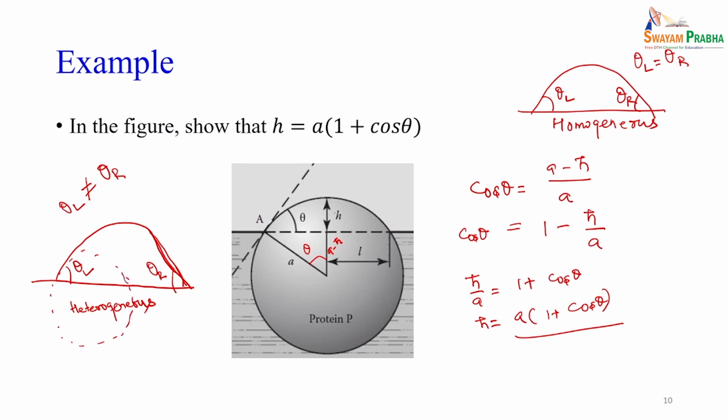You can fit one circle to the left side, and at the same time fit a second circle to the right side.